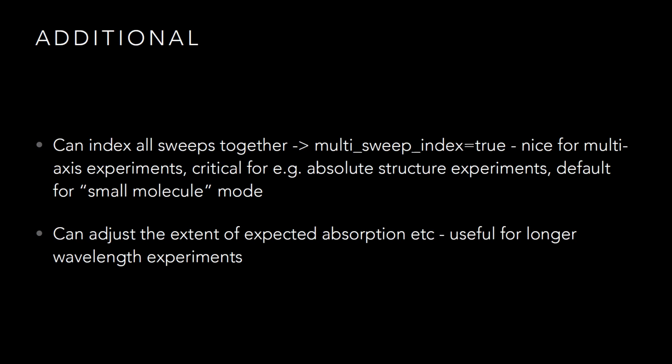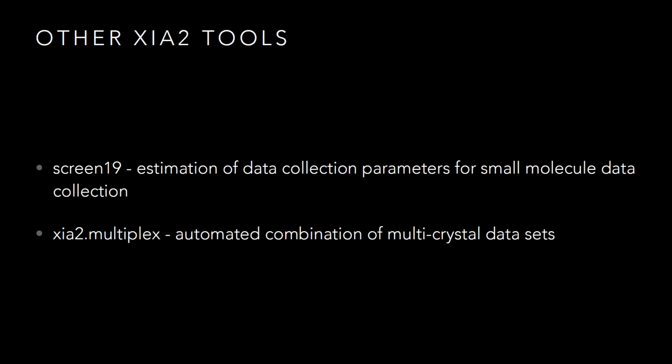There are some other options that you can tweak as well, but for the most part, this is stuff where it's there, it's automated, there is some documentation. So if you want to know about this, just remember there's this xia2 thing, there's documentation. Okay. There are some other xia2 tools that I will talk about very briefly as well.